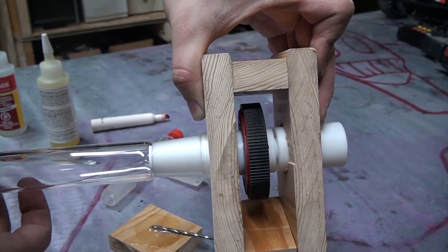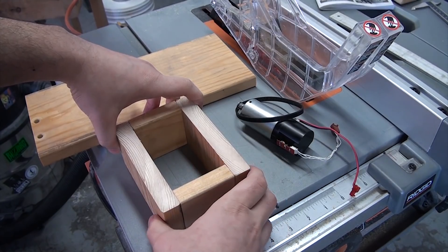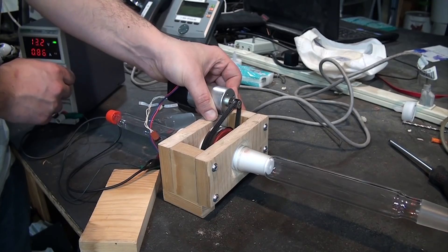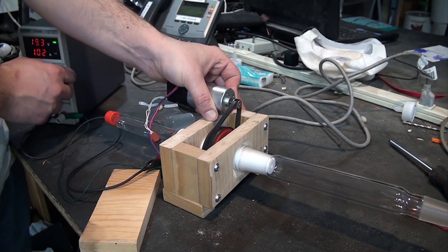I did a lot of this off camera since it's just building a wooden square, but the cliff notes are that it's a rectangle where the longest faces each have a hole cut in the middle to fit the coupling — one of which is smaller for a very tight fit on the upper half of the coupling, and one of which is bigger for a loose, free-moving fit on the lower half.